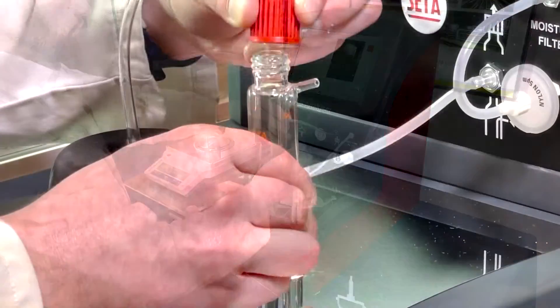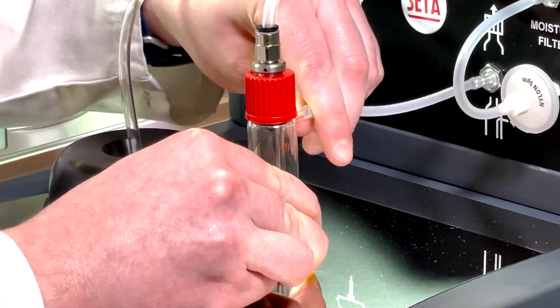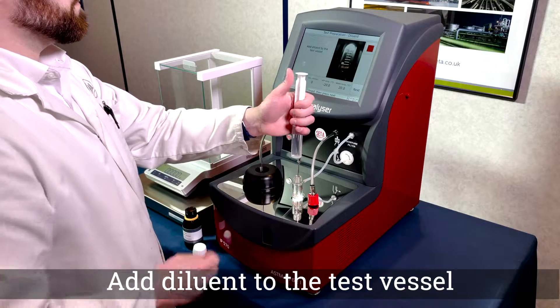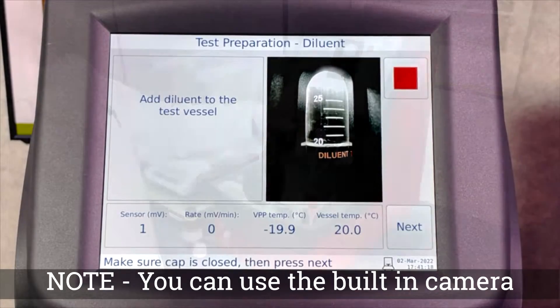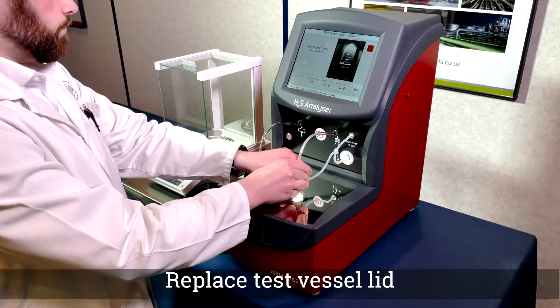Insert a clean test vessel and connect the inlet tubing as shown. Fill the test vessel with diluent to the 20ml line using either the video display or the front viewing window. It is recommended to use a syringe to avoid spillage. Replace the lid and ensure it is tightened firmly, then press next.